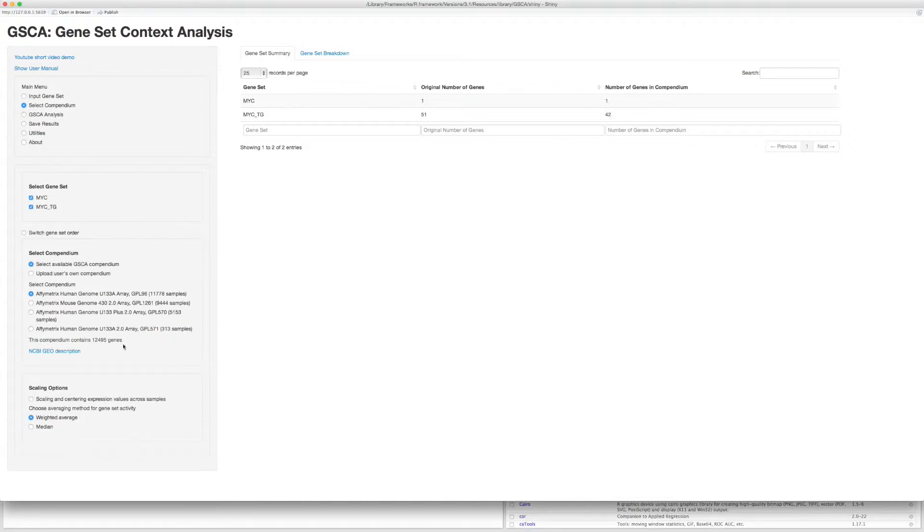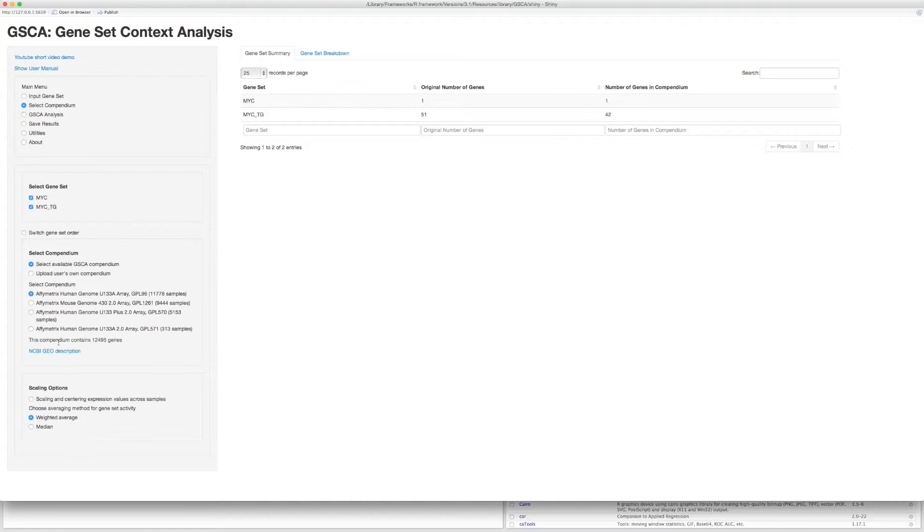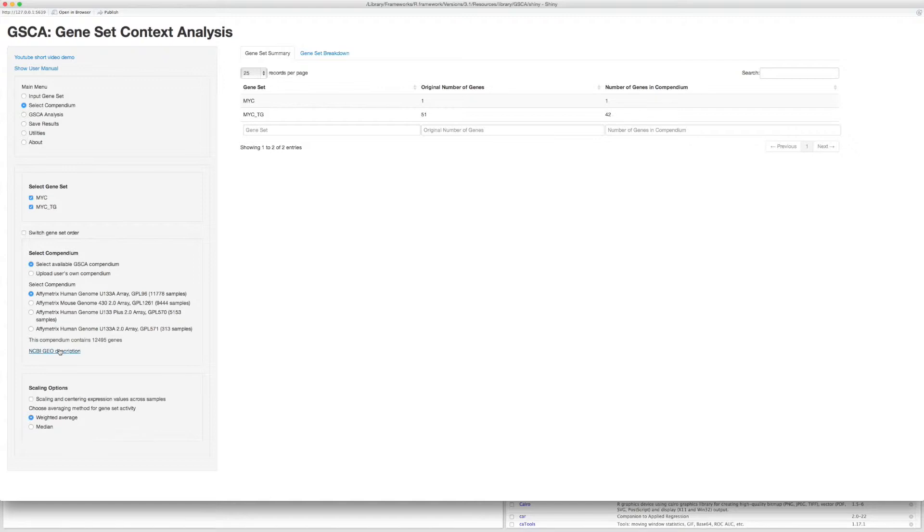Three of them contain human gene expression profiles, and one contains mouse expression profiles. This information shows how many samples and genes are included in each compendium. You can also go to the NCBI GEO description page for more details of the platform. If none of the gene sets contain any gene in the selected compendium, then you should consider changing the compendium or changing the input gene sets.